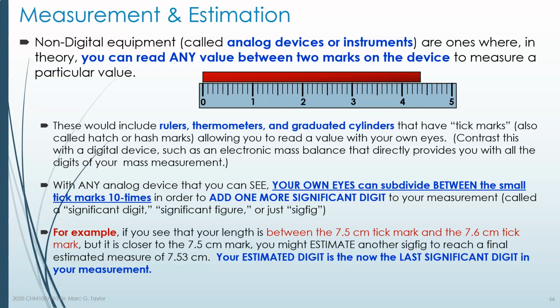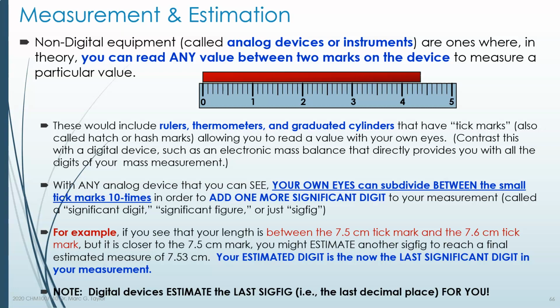If we look here at the top, at this example, you notice it's between 4.3 and 4.4. I would say that's a little more than halfway. I would give it 4.37, whatever the unit is, but you might say it's 4.36 or 4.38, depending on what your eye and your brain tells you it is. So there's always a range of what is acceptable, but you do have to be careful you don't go outside of what is really an acceptable range by a person with good eyesight.